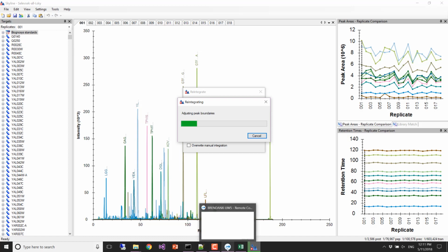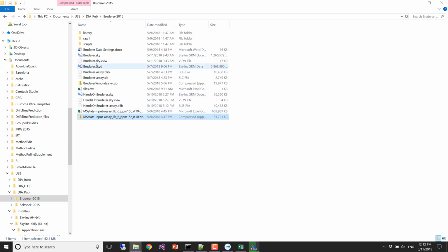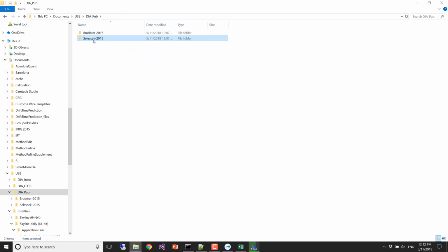So we have a little bit more time. Do people have questions? Is everybody following how we got these 3 things and what we potentially are going to test quantitatively? We would actually have to apply the osmotic shock replicate annotations, the bioreplicate and condition, to this document as well, but we're pretty close to done with this document. And really to do the statistical analysis, you just need these CSV files that we just unzipped.